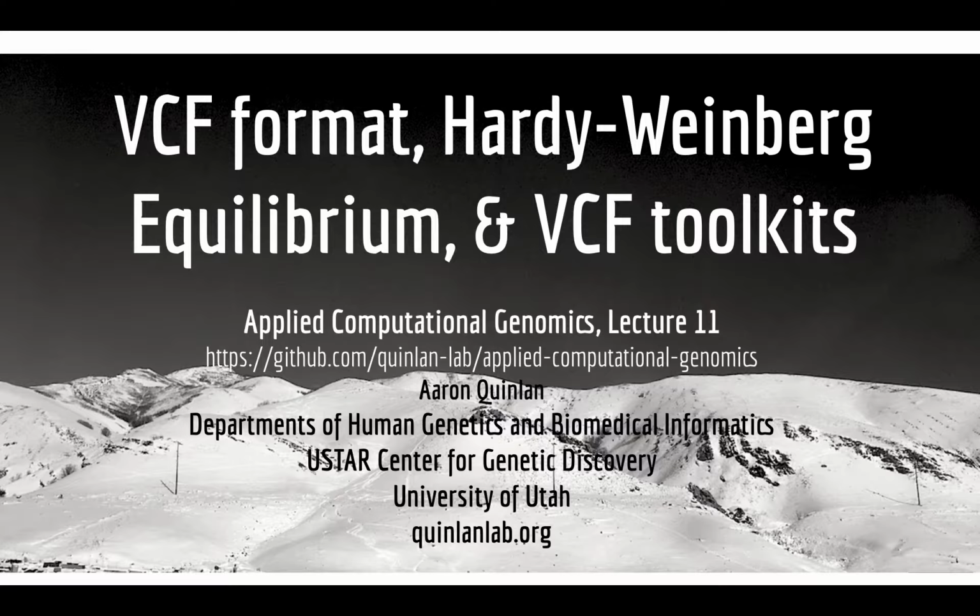It's a complicated format, yet again. We're going to walk through the details of it. And then we're going to talk a little bit about some basic population genetics, something called Hardy-Weinberg Equilibrium, which is super useful for various scenarios. And then one or two toolkits that we can use to work with VCF files, because if we sequence even just one person in this room, we expect something like 4 million sites to be emitted in that VCF file, because any two humans differ at about 4 million single nucleotide change sites in the genome.